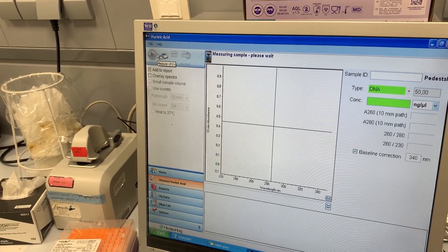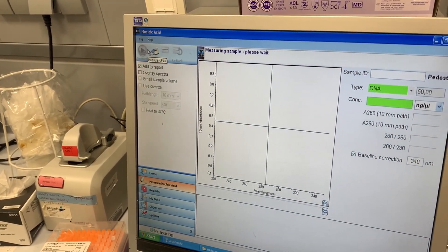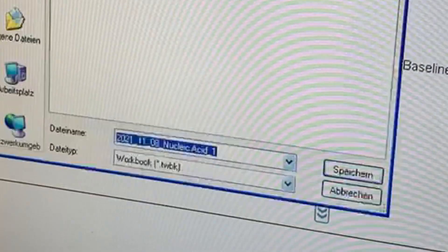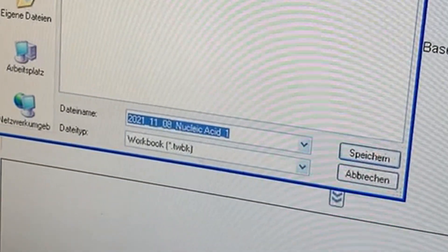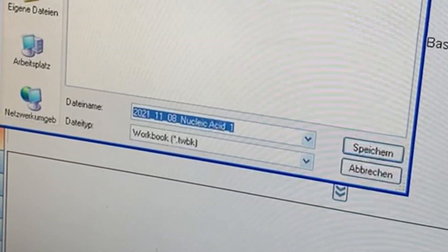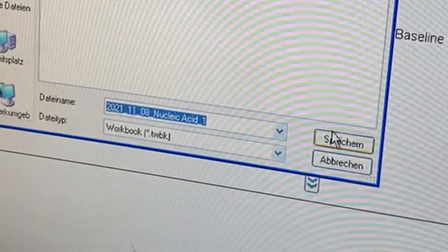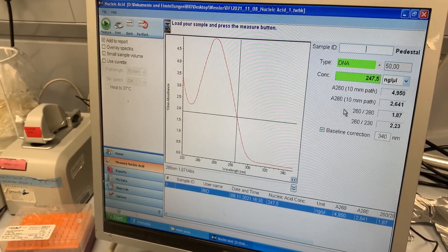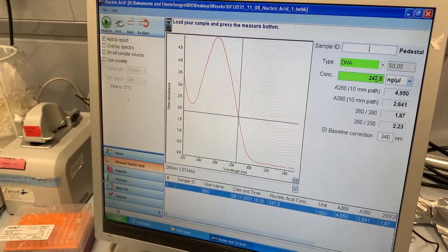Then you click measure. Now the program will ask you to save your data, and your measurement results will appear in the upper right corner in green.